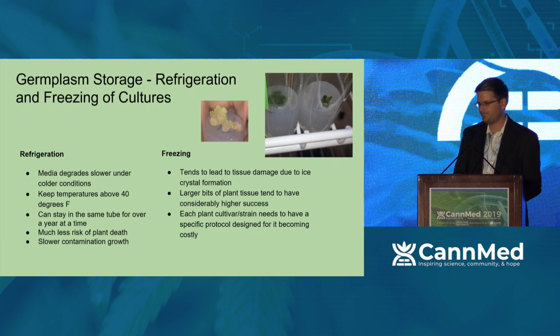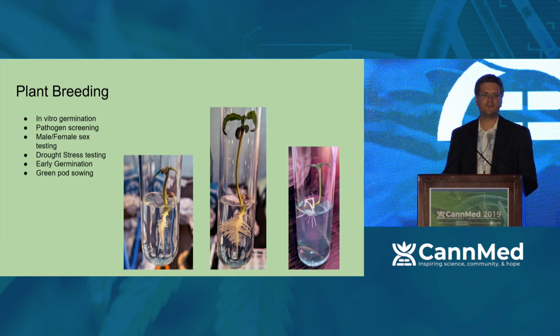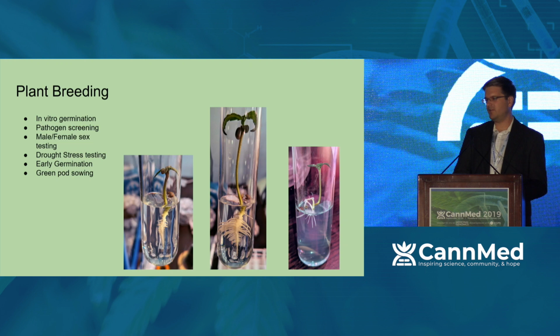Plant breeding was another aspect of cannabis tissue culture that a lot of people have had interest in, so I'll touch briefly on it. You can germinate plants in vitro, so inside the test tube. It takes about 8 days for them to get to about the point of the middle picture, and you can screen them for pathogens.